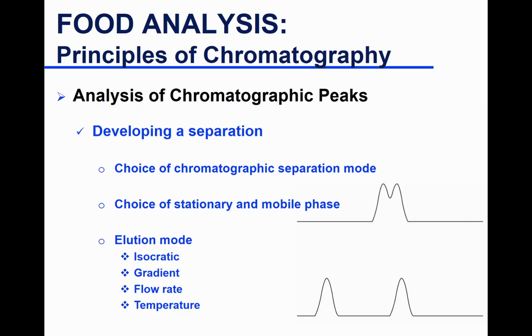And then, based on your references, some might say you need reverse phase chromatography. Others might say you might be able to go with hydrophilic interaction chromatography, which I didn't talk about. Or hydrophobic interaction chromatography, no, it doesn't work.